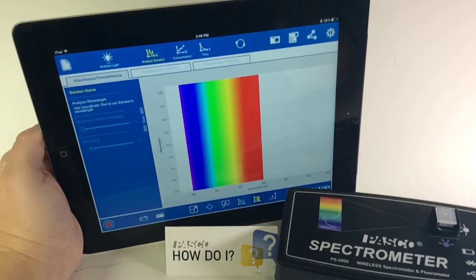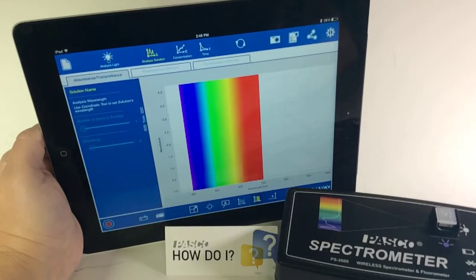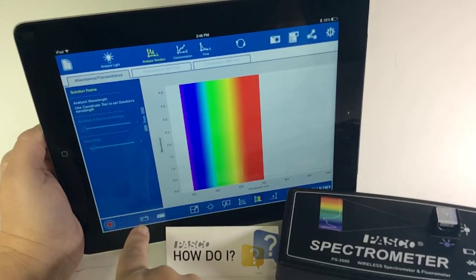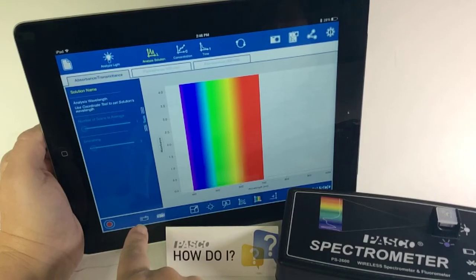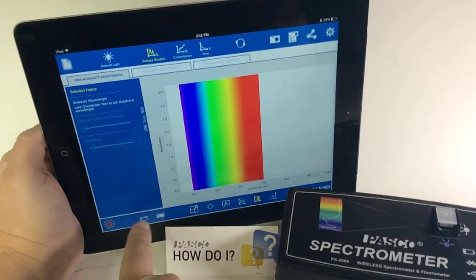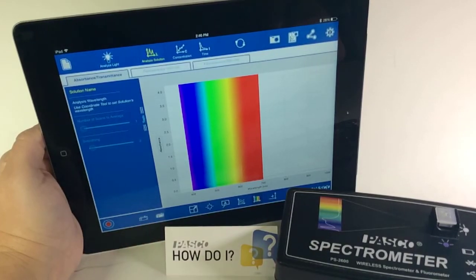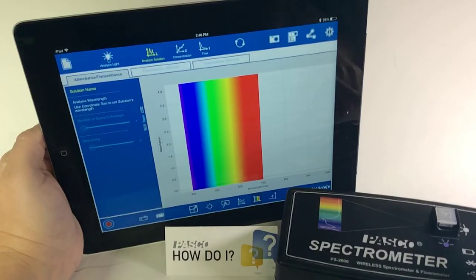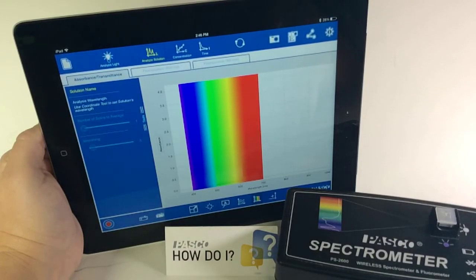In the lower left near the Data Record are two Calibrate buttons, one Calibrate Dark and one Calibrate Light. I have just a reference sample in the spectrometer right now, just some water.